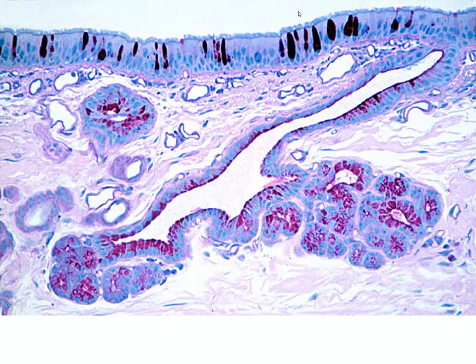This a little bit more easily, we can see the pseudostratified nature of the epithelium. There we can see the cilia present on the apical surface and the goblet cells that have the mucinogen granules staining a dark color.